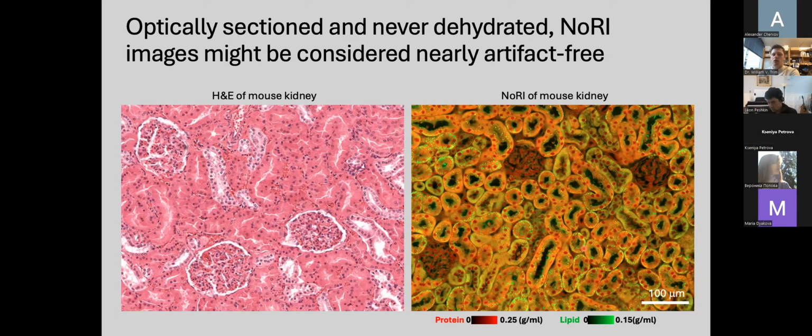And if we look particularly here, these very bright spots of green are quite important. They're lipid droplets, which are found throughout the body in various cell types. But as we'll get on to soon, lipid droplets and lipid balance within cells is fundamental to many pathologies and diseases more broadly, including aging.